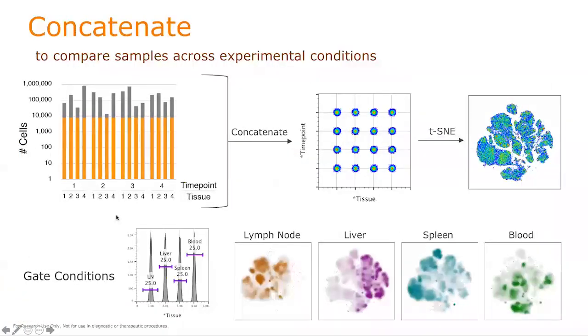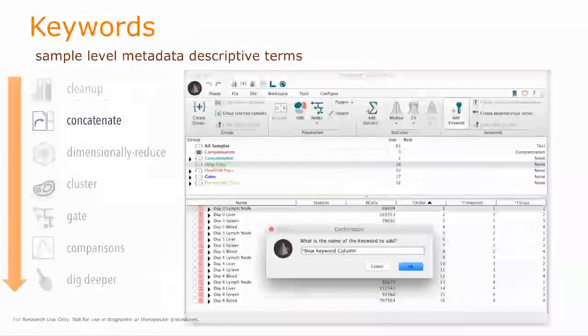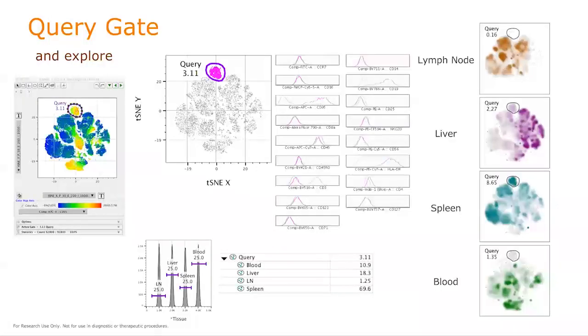And you can make that comparison that you want depending on your experiment and the study that you're trying to, the hypotheses that you're trying to test. So what can you do with this dimensionally reduced data space? Quite a bit, actually. I've shown you can heat map across the data space any other marker. So this is checking a color axis box here in the graph window and choosing another parameter to see where it is distributed, where its expression pattern is in this continent structure.